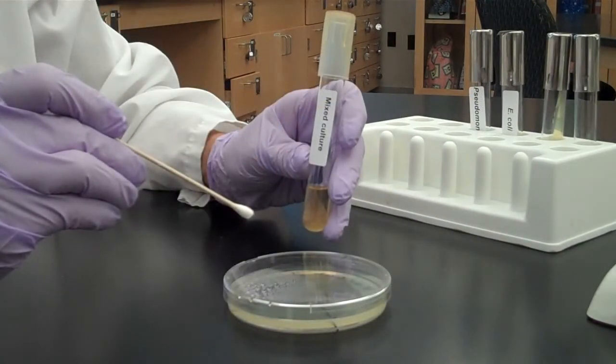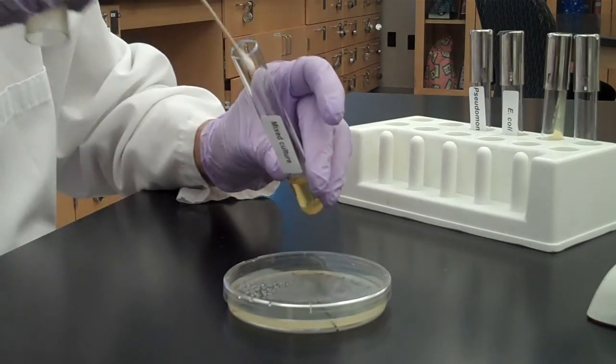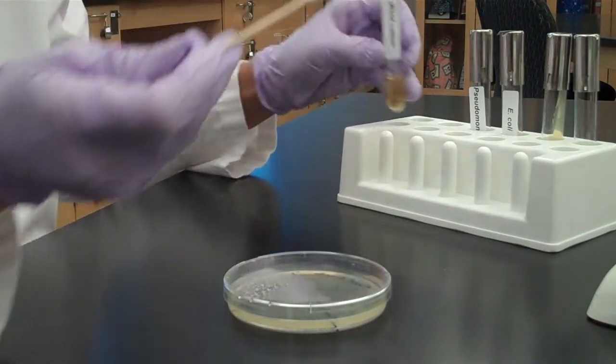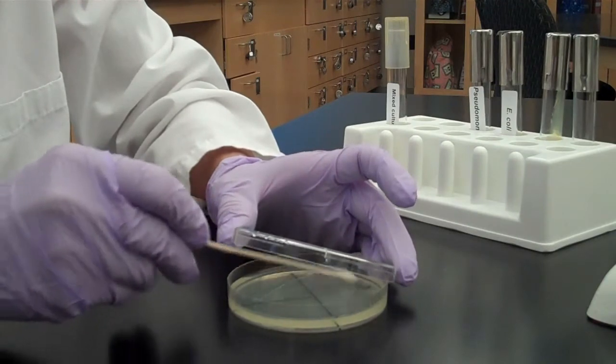First we're going to demonstrate a streak plate of a mixed culture of bacteria. We're going to use a swab. Dip your sterile swab into the mixed culture and then inoculate the first section of the streak plate. Be sure to keep your lid as low as you can.